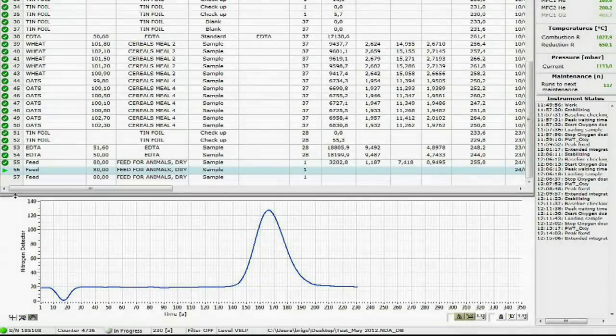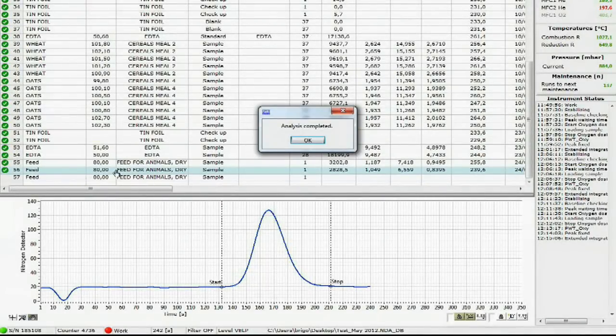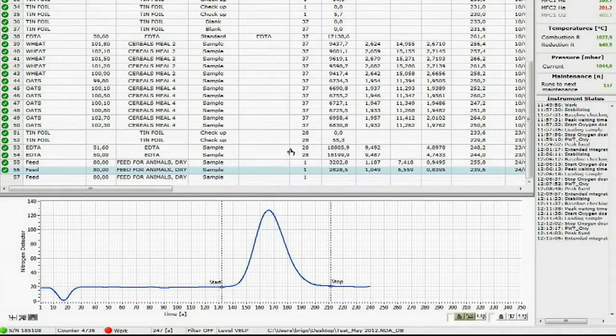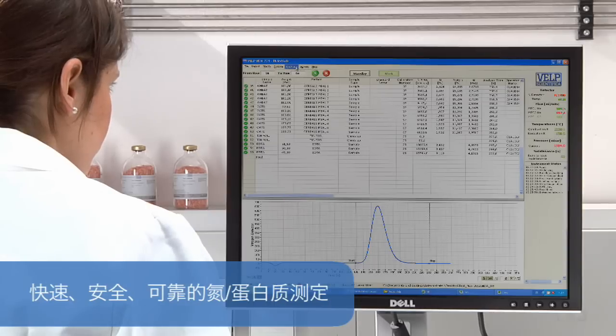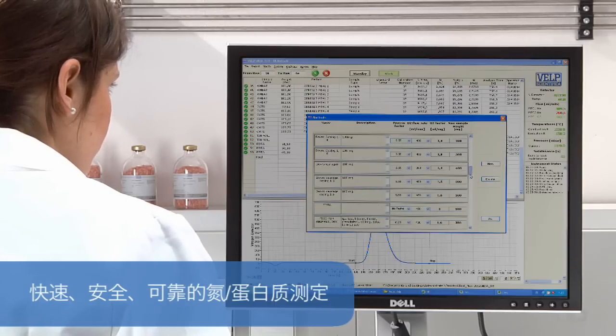To increase precision and accuracy, all gases are tested. The NDA 701 has no requirement for hazardous chemicals, providing fast, safe, and proven nitrogen and protein determination.